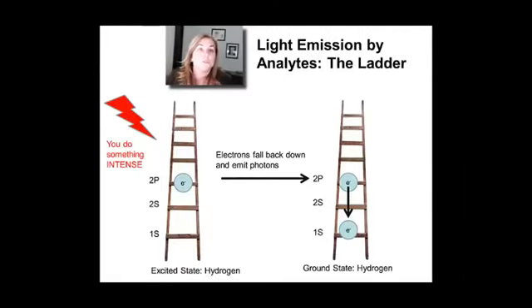that were excited. So to go back to the ladder analogy, which I like very much, once I get over the fact that it's not an actual orbital, in emission, you're starting with atoms in an excited state. Now you got them excited through who knows what means. If it's a neon light, you zapped it with electricity. We're going to learn all about inductively coupled plasma, or ICP. And ICP excites them by putting atoms into a plasma. So that's another way, so you can heat them up really, really high in temperature. And all of those things create emission of light.